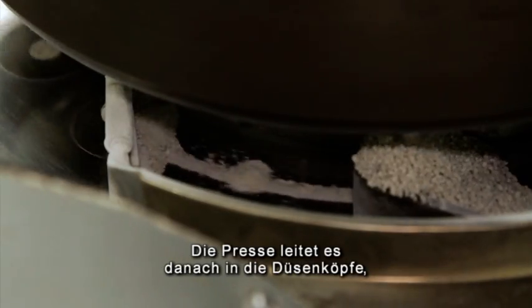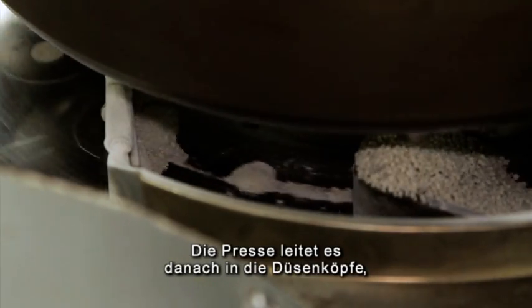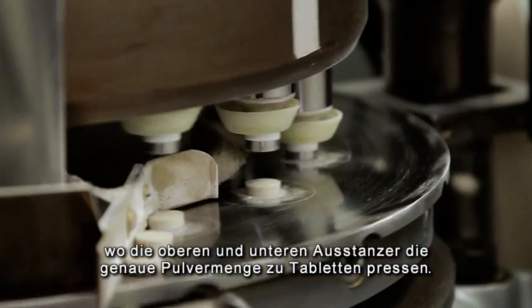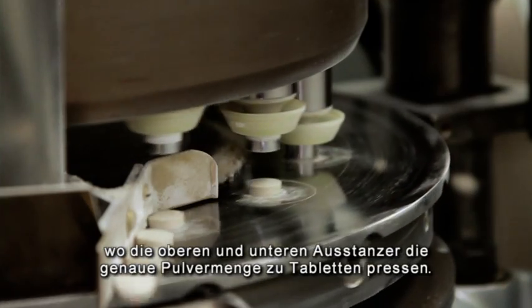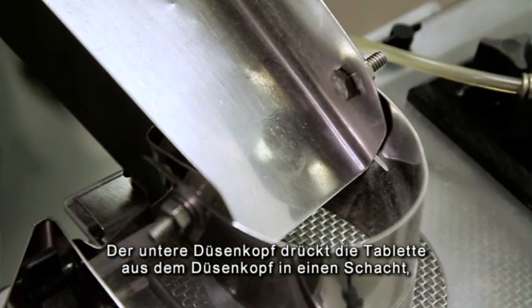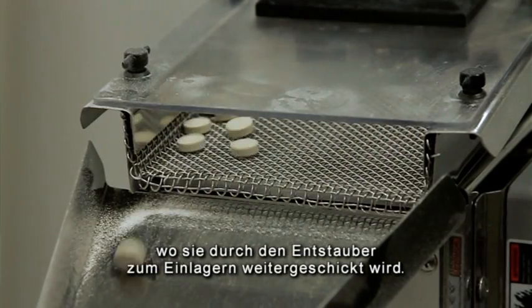The tablet press then takes the material through a feed frame and dispenses it into the dies, and the upper and lower punches press the exact amount of powder into a tablet. The lower die then kicks the tablet back out of the die table and off onto a chute where it goes through a de-duster for storage.